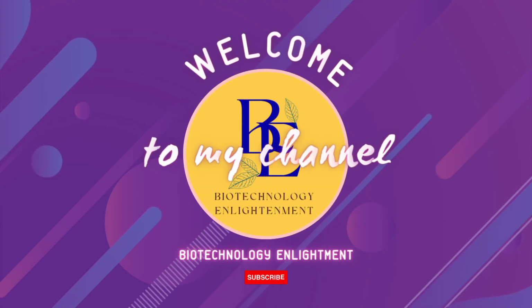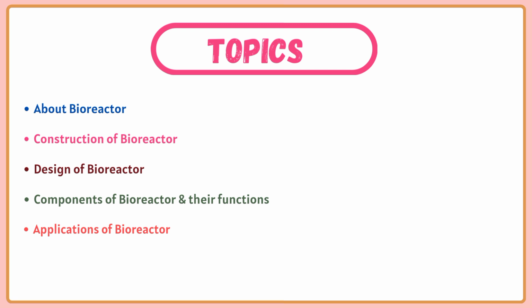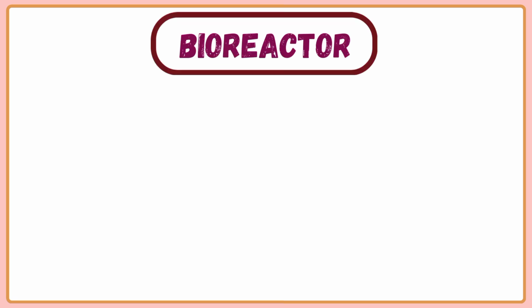Welcome everyone. In this video, we will discuss the bioreactor and its components, we will discuss the functions of all components in more detail, and also discuss the applications of bioreactor. So let's begin. First, what is a bioreactor?